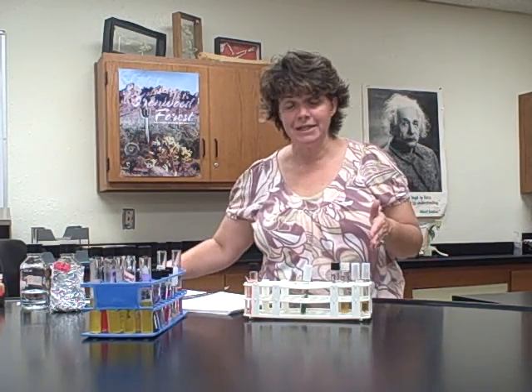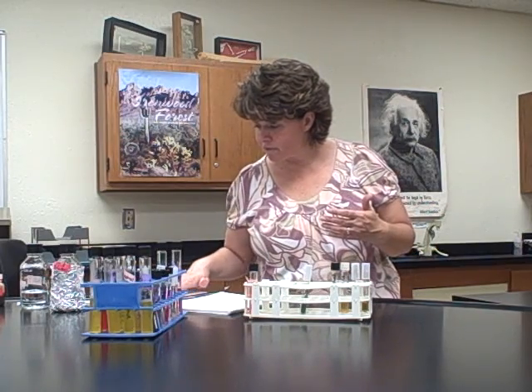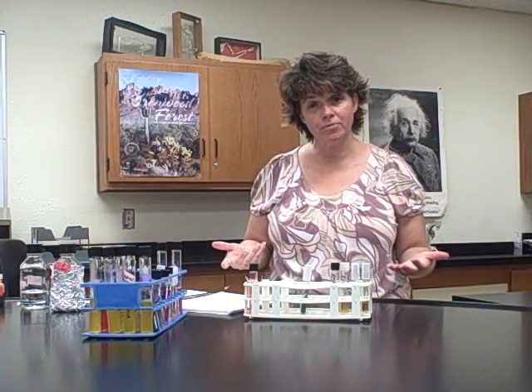If you didn't get results, look at somebody else, but definitely compare what you did to what other people did. The other thing is you'll have to go and find the other bacteria, the other cultures that were done. So to fill out that table, you're going to be required to go around the entire classroom, look at their tubes, interpret the results, and work with the other groups, okay? The first thing you're going to look at is growth. So what did I say growth was? Well, I said it was turbid, okay?